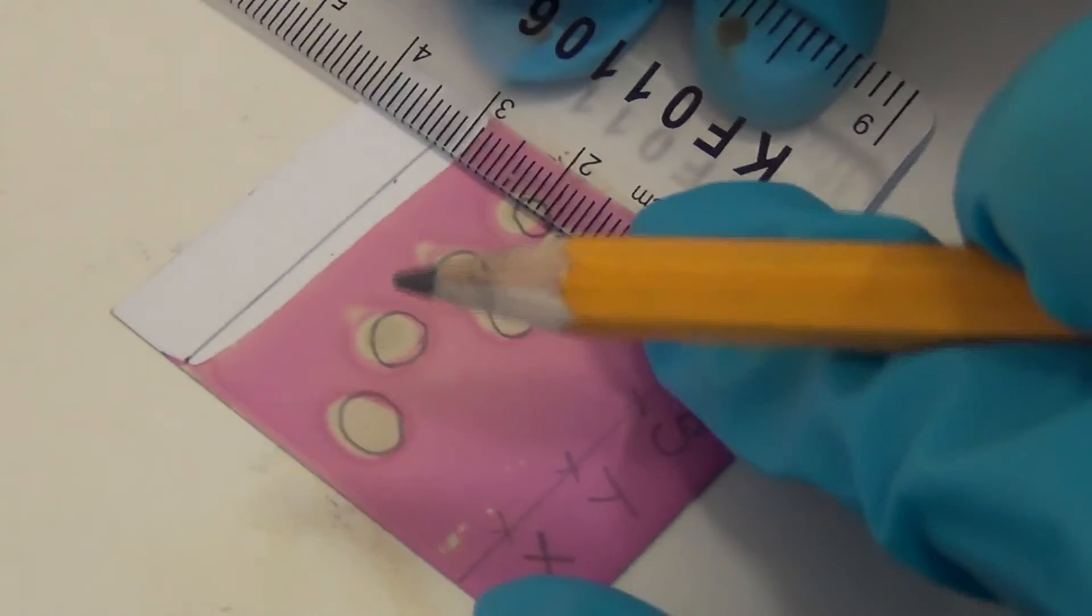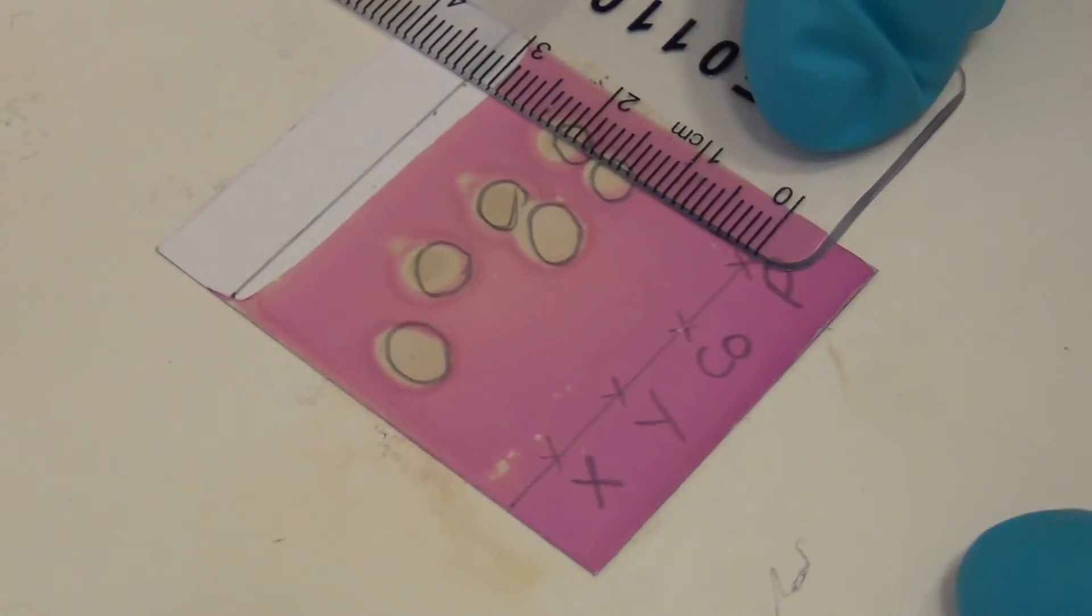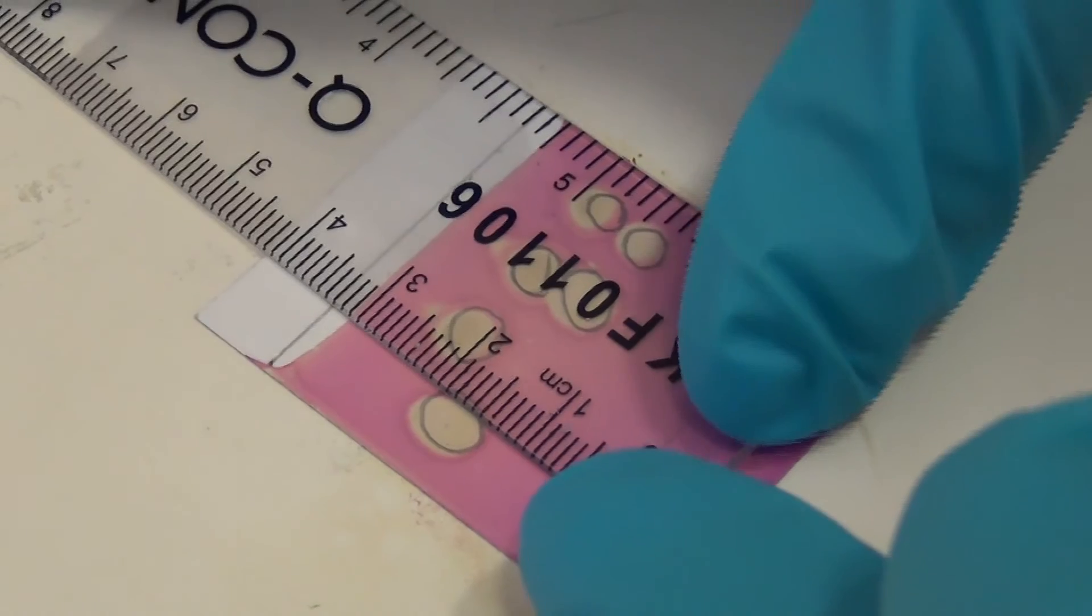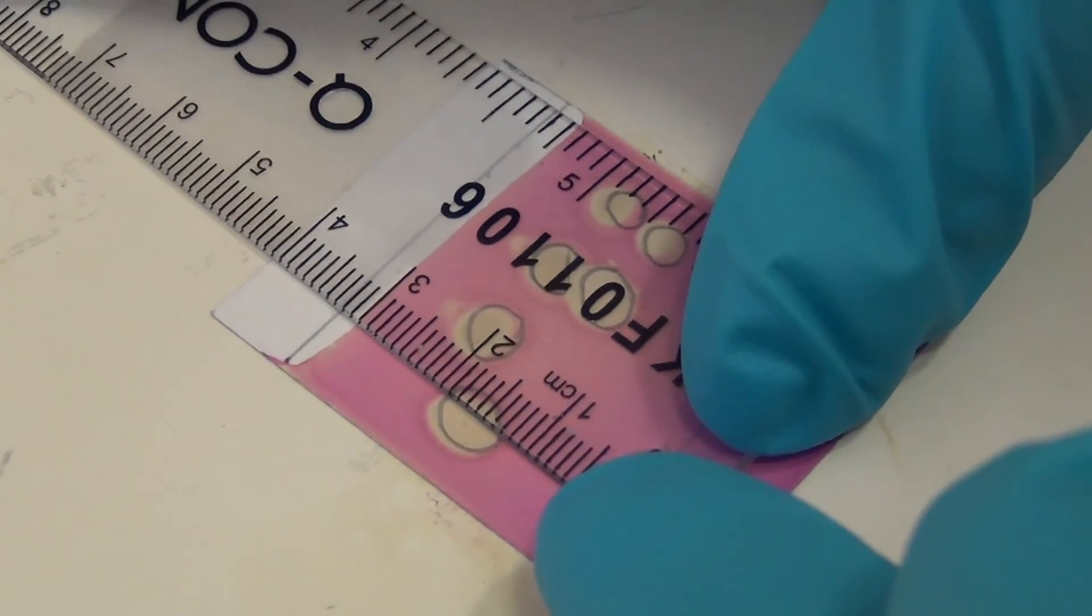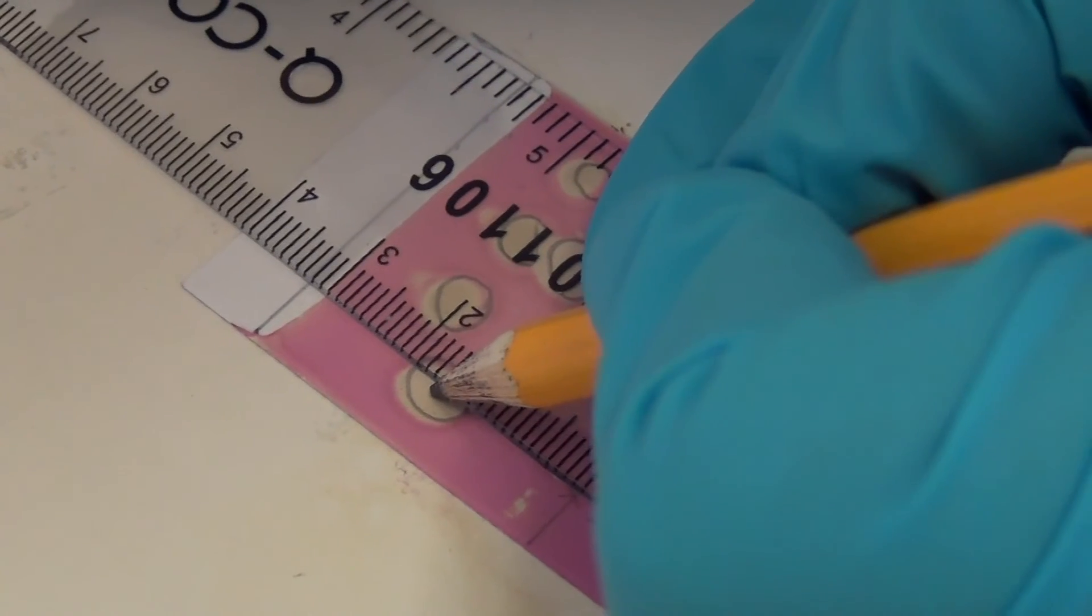Now we need to measure the RF values for our spots. Firstly, you use a ruler to measure the distance travelled by the solvent front from the baseline. Here it is 3.2 centimetres. Then you measure the distance from the baseline where the samples were spotted, to the middle of each spot on the plate, noting down these values.